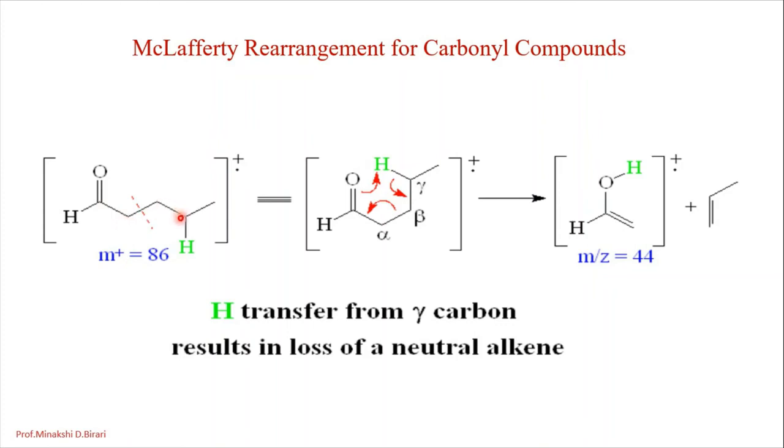As we know, only those molecules which satisfy the conditions can undergo McLafferty rearrangement. So the first important condition, having pi electrons. It should have an abstractable gamma hydrogen and also a suitably located heteroatom. So all these conditions are present in the given example. So the McLafferty rearrangement is possible for this example.